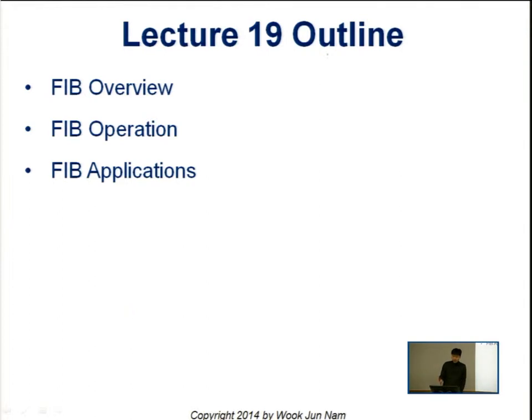So this is the lecture outline. We're going to talk about an overview of the focused ion beam, and I'm going to talk a little bit about the operation and then the application of this technique.